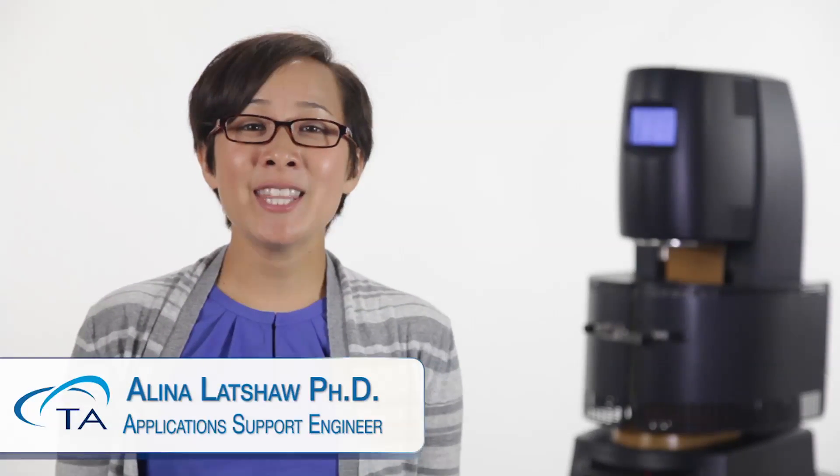Welcome to another TA Tech Tip. In this TA Tech Tip, we will use the three-point bending clamp to demonstrate dynamic mechanical analysis capabilities on the Discovery Hybrid Rheometer.